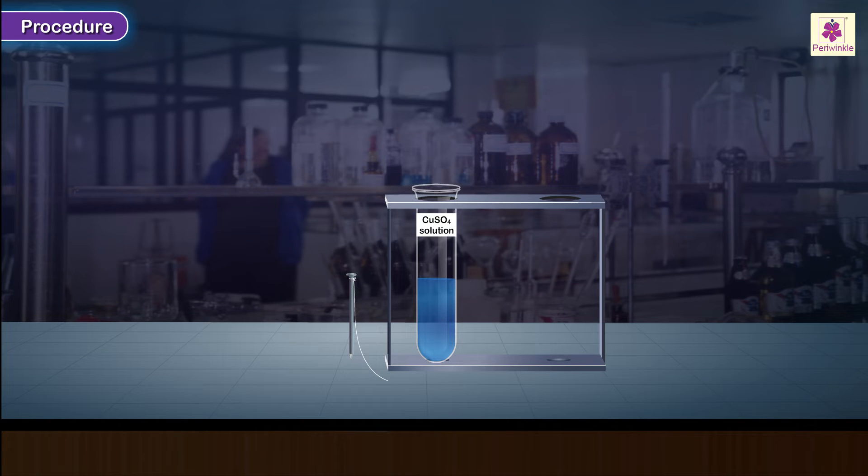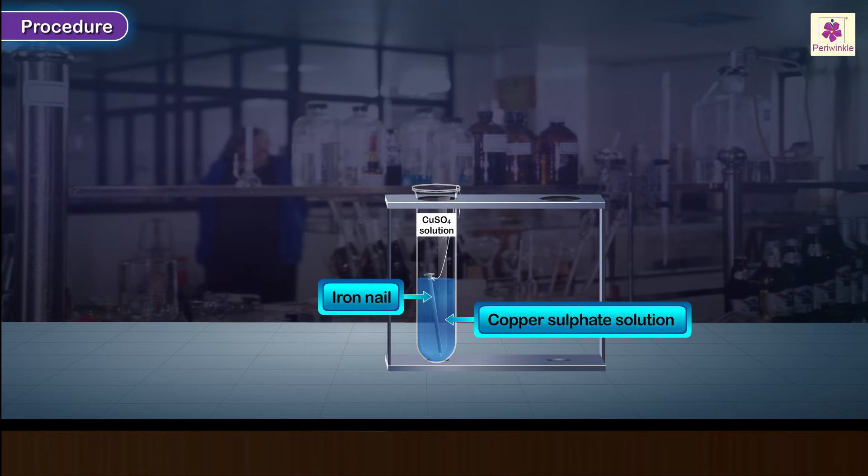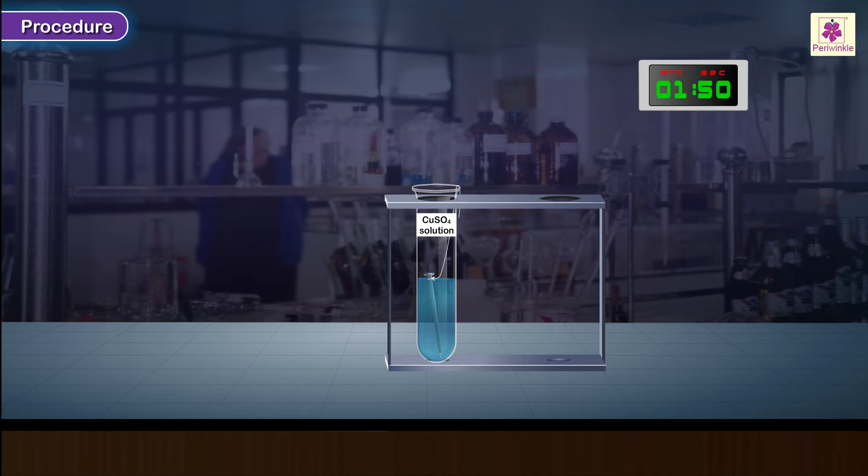Using the thread, lower the iron nail into the test tube containing copper sulphate solution. Ensure that the entire nail or a major part of it is immersed in the solution. Leave the arrangement undisturbed for about 25 to 30 minutes.